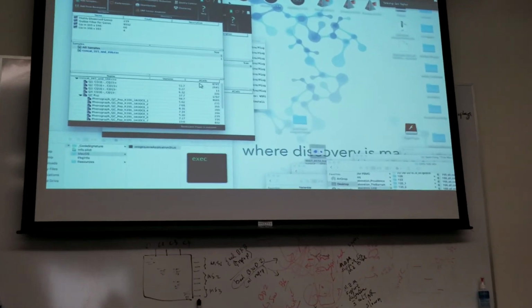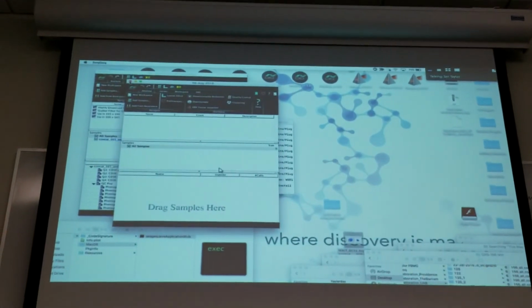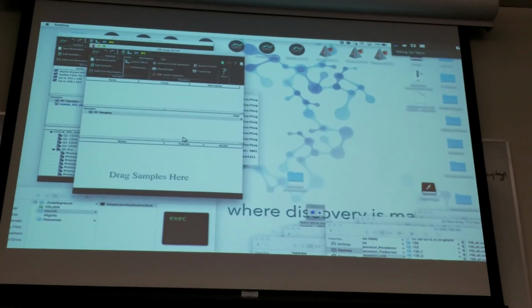For the what time, sorry? Clonotype? Oh, clonotype. Yeah, so it utilizes the file that comes with VDJ sequencing in order to identify the different genes associated with the different regions of the clonotype.